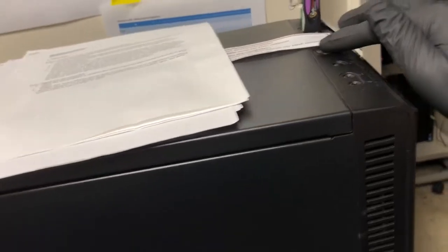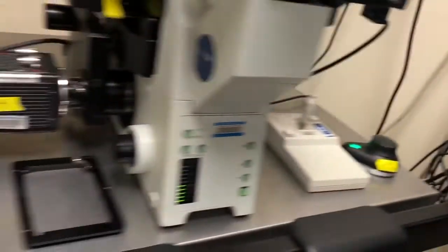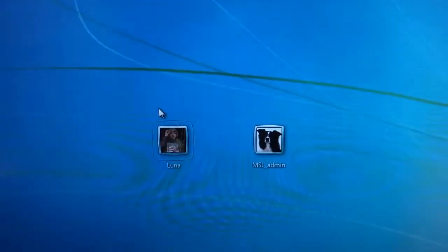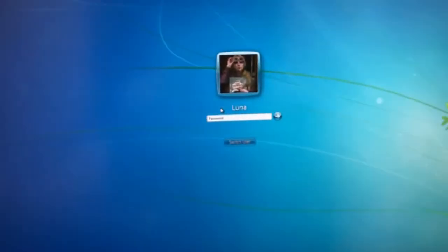Turn on computer and log in. So the computer can be turned on from here. That button right there. And it'll take 20 seconds to fully load up. The computer has finished loading. If we click here where it says Luna, the password is MSL. So the acronym for the lab, all in lowercase.